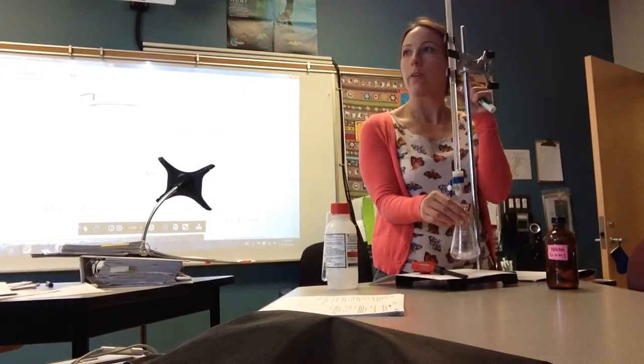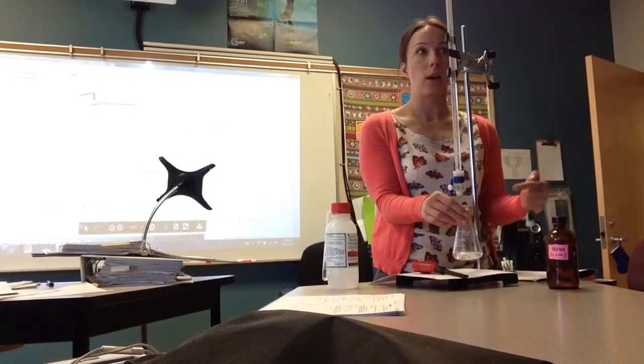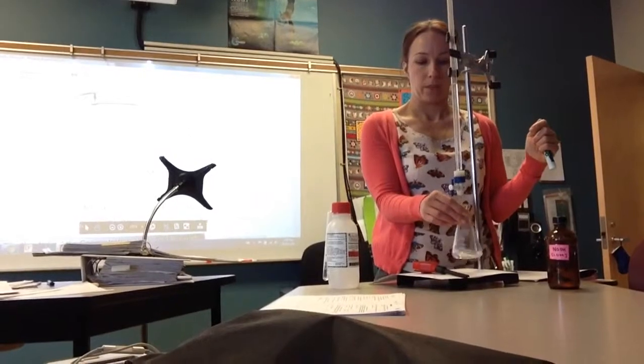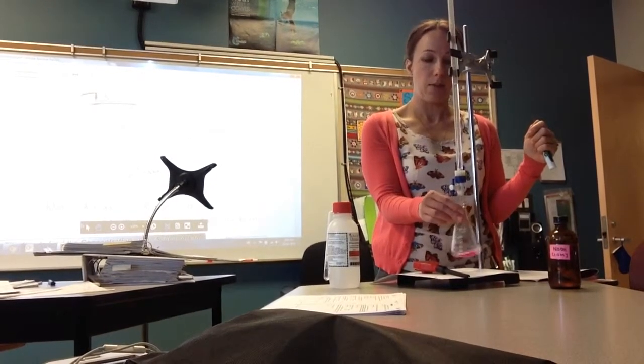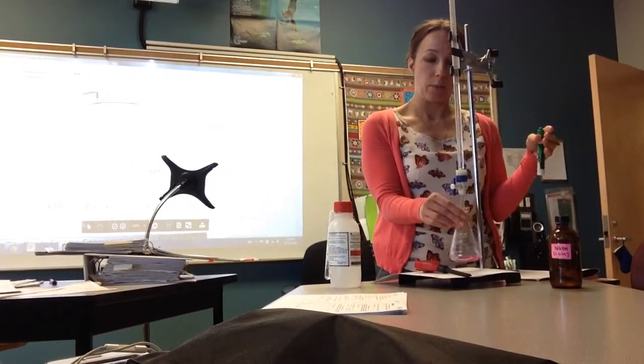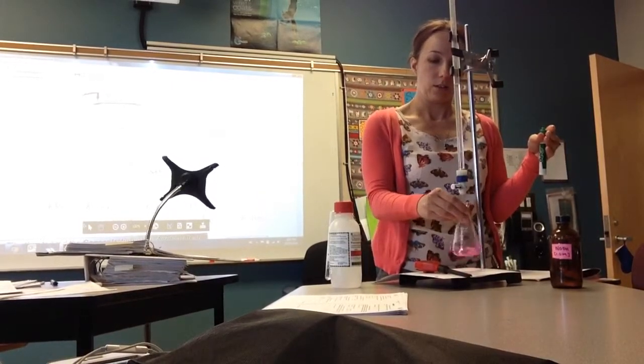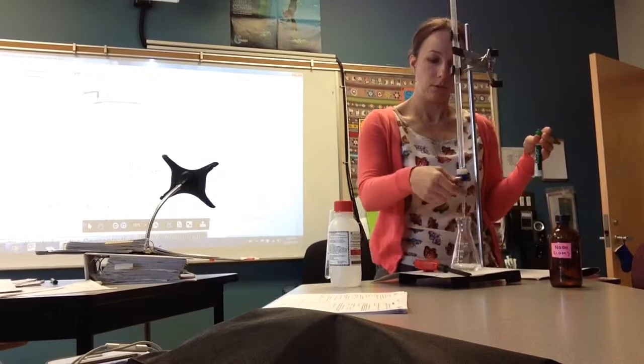All happening within that 1 drop. pH 1 to pH 14. Okay? And in that time, I'll know I've reached it because the color will change.